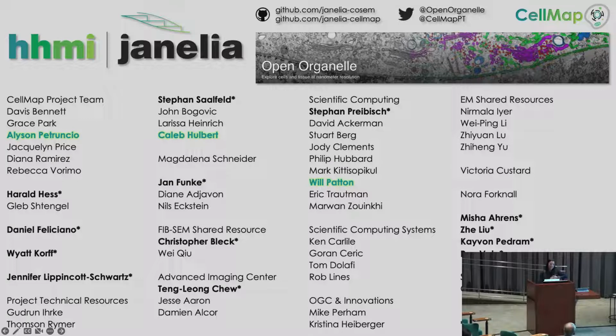They were all immortal cell lines: 2 HeLa cells, a Jurkat, a macrophage, and a SUM159 cell. And even within the 2 HeLa cells, even though they were from the same cover slip, things didn't transfer well between them all the time.